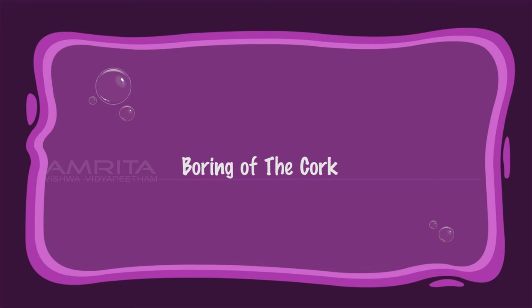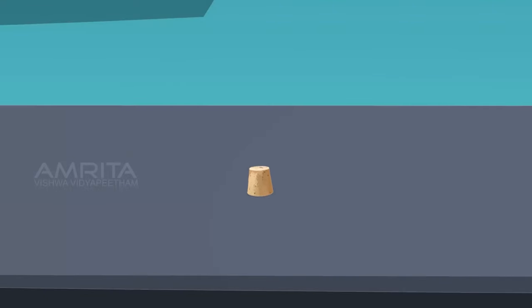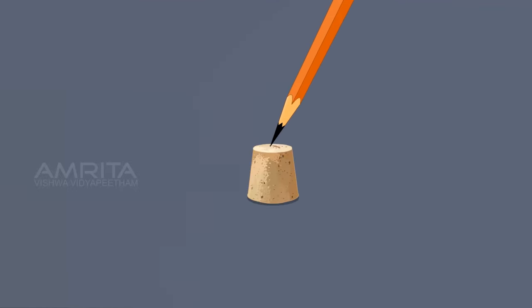Boring of the cork: Place the cork on the table with its narrow end upward. Mark the position of the hole on both sides of the cork with a pencil.